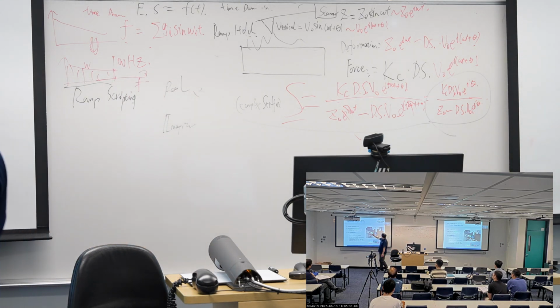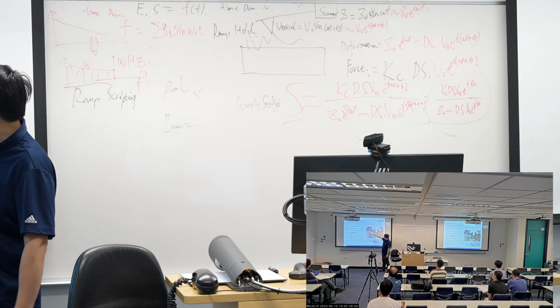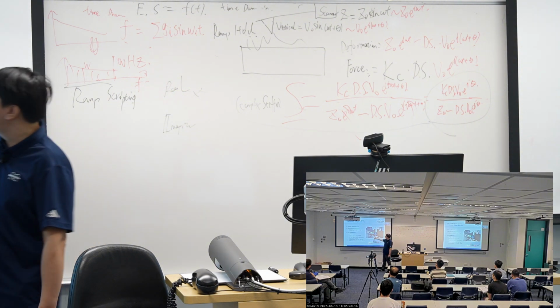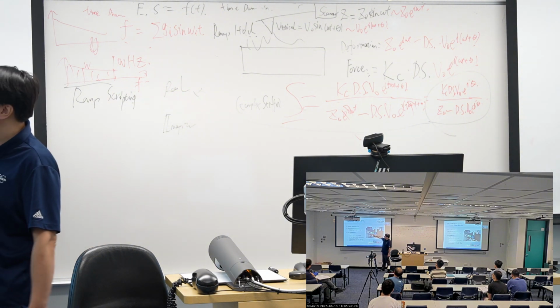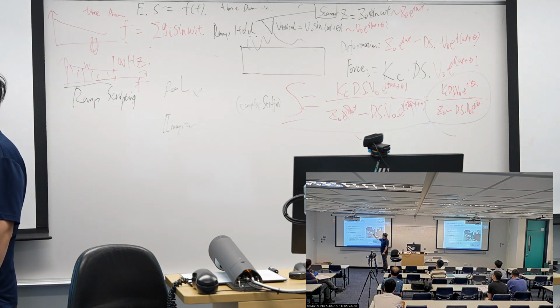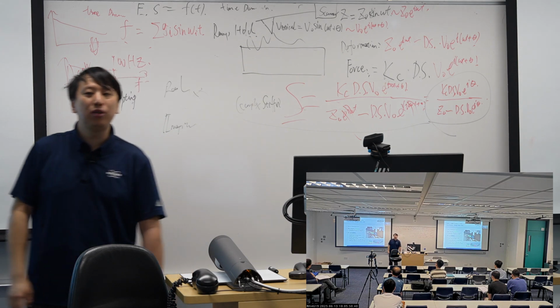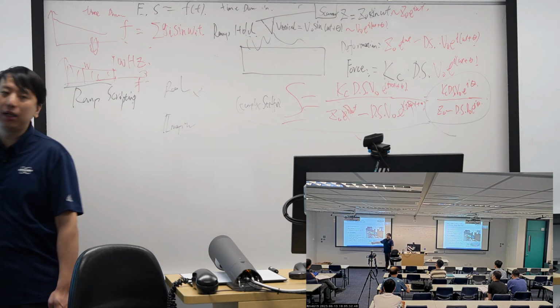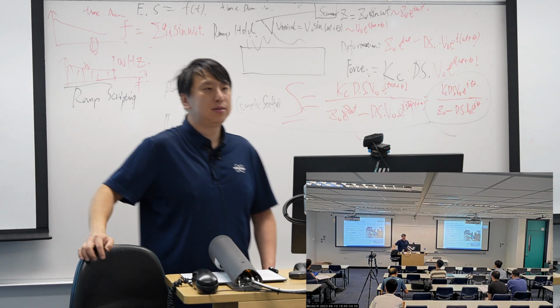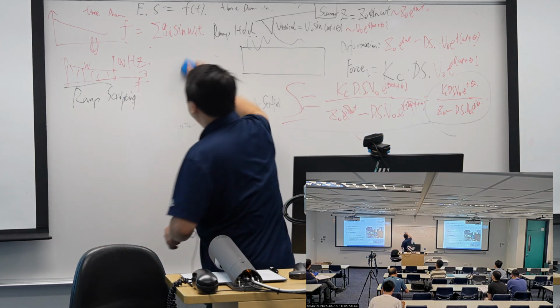And then we have a high frequency actuator, a tiny one next to the heater. It can change the frequency up to 20 kilohertz. If we're not using this one, we can only go to about 300 hertz, and with this one, we can go to 20 kilohertz.